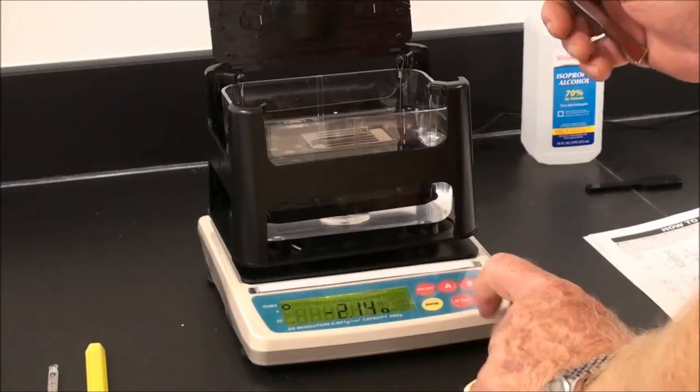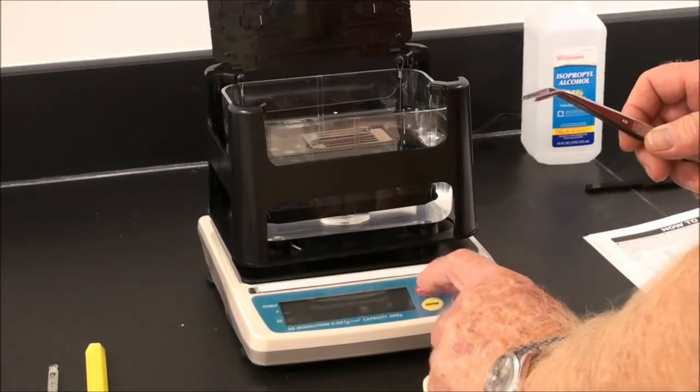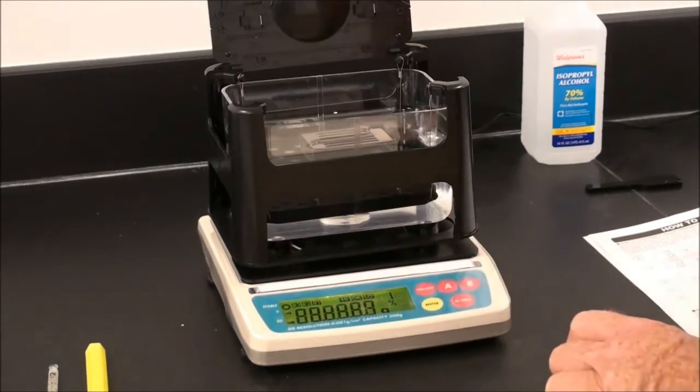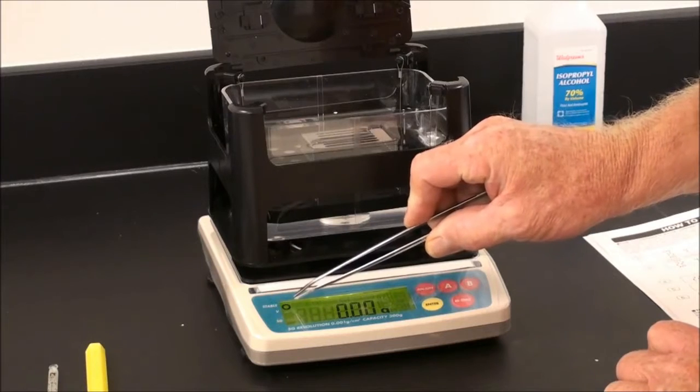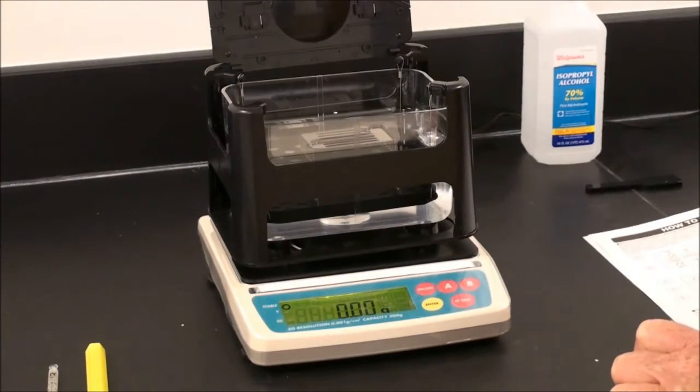If you don't get a good zero, simply turn off and back on and allow the balance to re-zero. The stability mark indicates the balance is ready for operation.